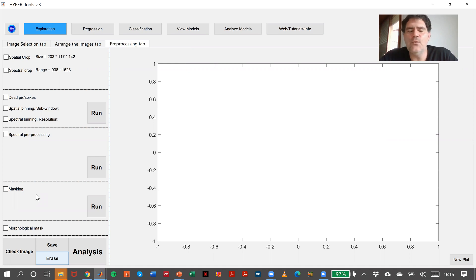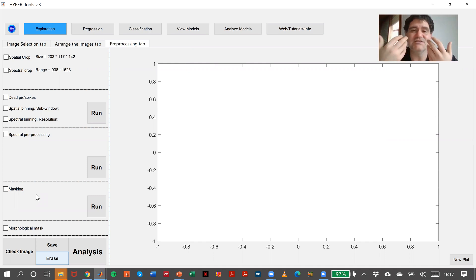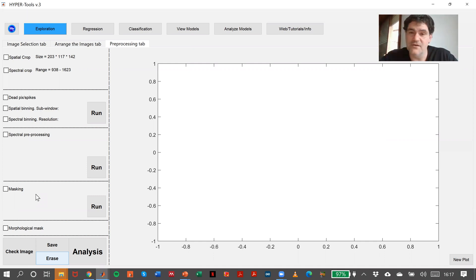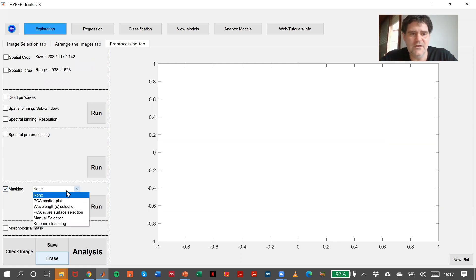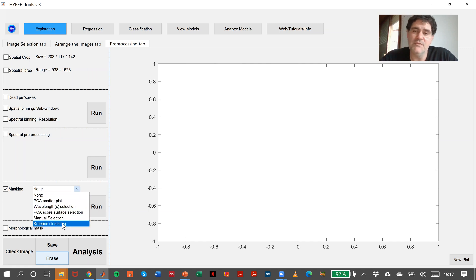We don't have to waste components or efforts trying to model a background that will only generate noise or difficulties. We have several methods here implemented like PCA Scattered Cloud, Wavelength Selection, PCA Score Surface, Manual Selection, or K-Means Clustering.